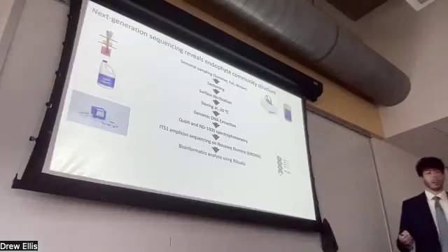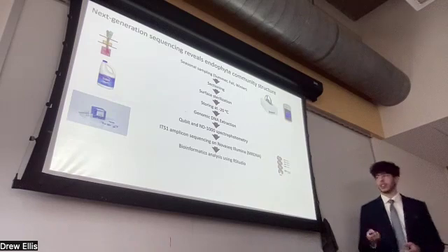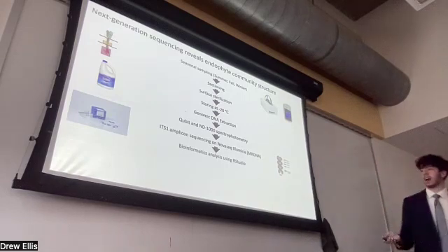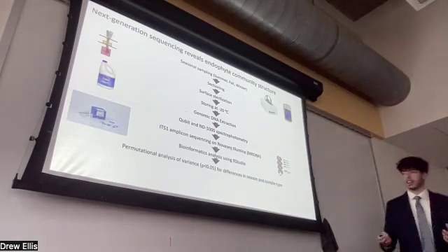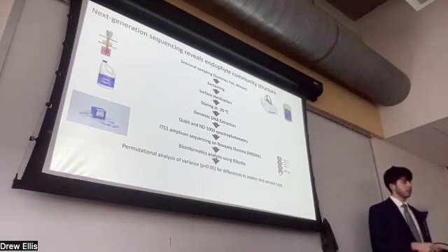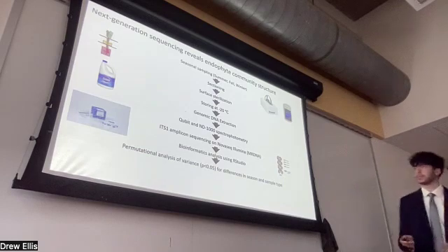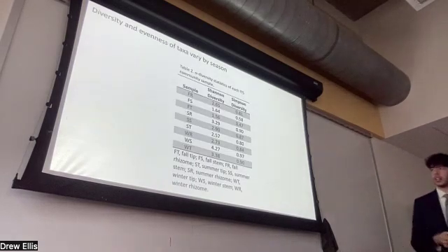Then we input our raw FASTQ files containing all of our sequences into our RStudio pipeline for analysis, and then tested for difference in season and sample type, similar to what we did for our cultured isolates, using RStudio as well, using a PERMANOVA. Okay, so what do we see?